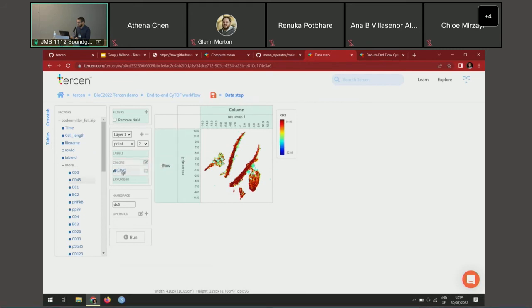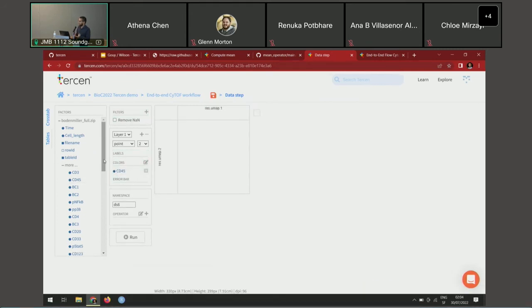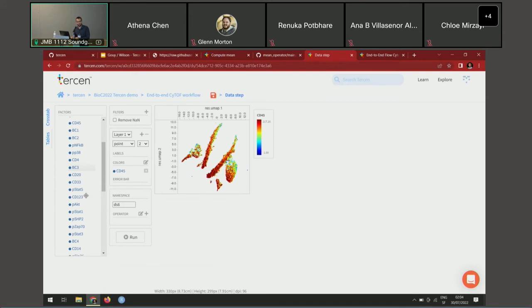So as an immunologist, I'd love to do that, right? Because for me, CD something and so on, they don't mean a lot. But I know that if I show that to immunologists, they would directly look for a relevant marker and have a look, oh, this group, this cluster is this cell type instantly. This is magic.